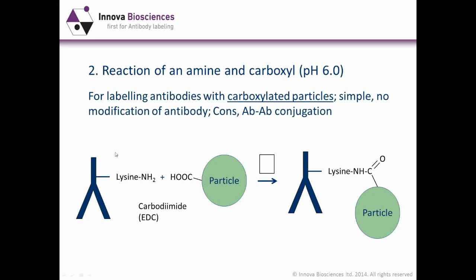So here we have antibody with lysine again, particle with a carboxyl. And with this type of chemistry, you need another reagent called a carbodiimide. There are many of these. You don't need to look any further than EDC. Just use EDC. It's cheap, really reliable. And I've not bothered showing the chemistry of this.